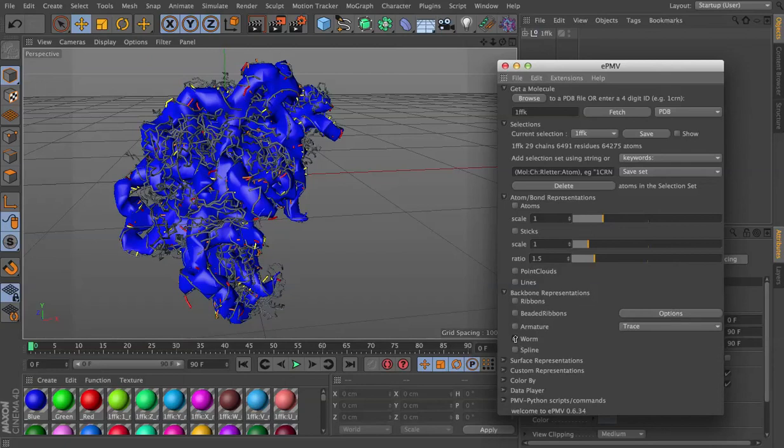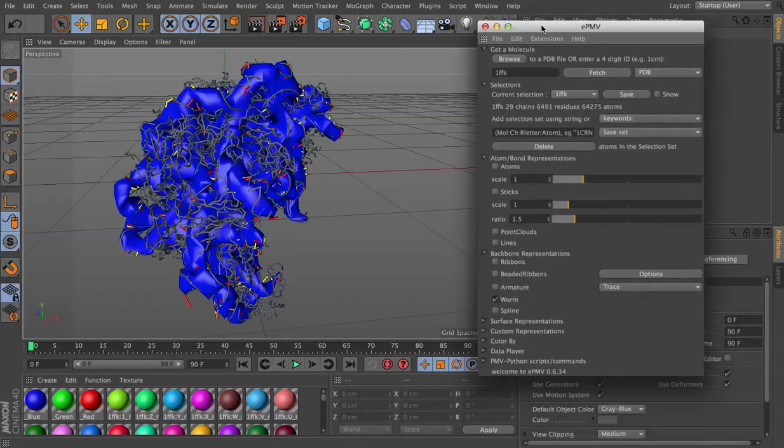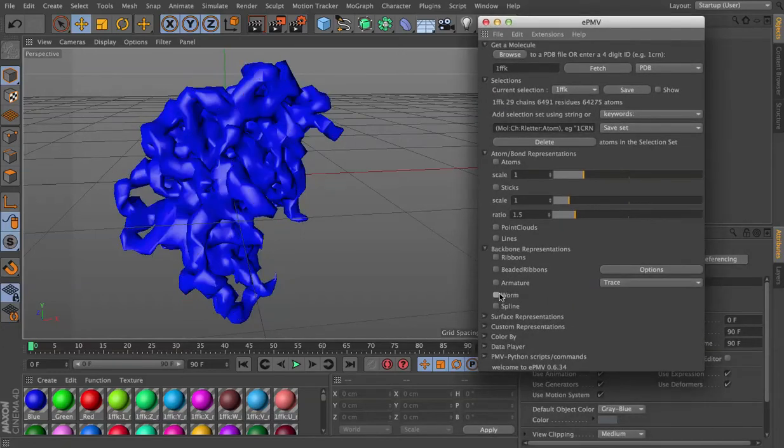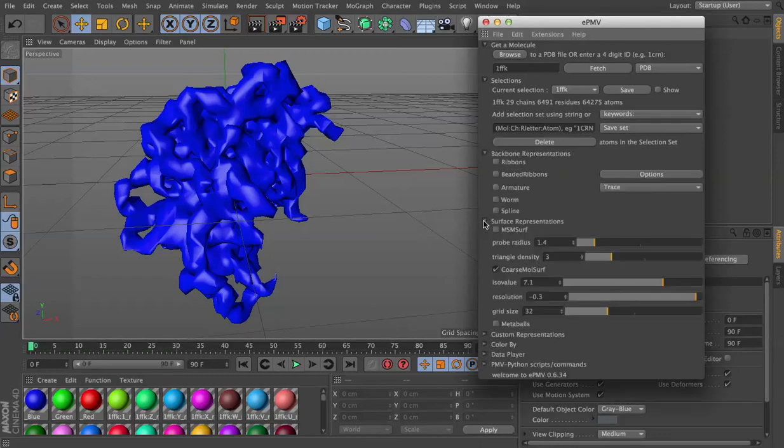So let's puff that up, and to make this work a little bit faster in real time, I'm going to turn off the worm representation, unfold our surface representation.